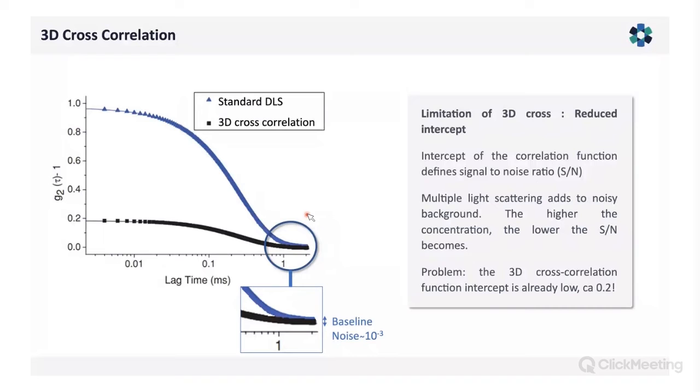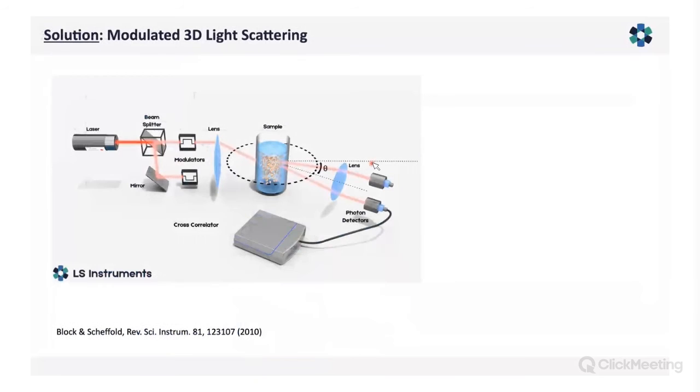It's not much, but if you give up a factor of 4 and you only have a factor of 100 to 1,000, then this can be a disadvantage, and it's better to overcome it. If you could overcome this, you would get a much better signal to noise, and you could measure the same data much faster. So how do we do that?